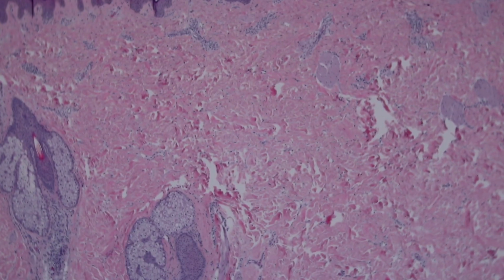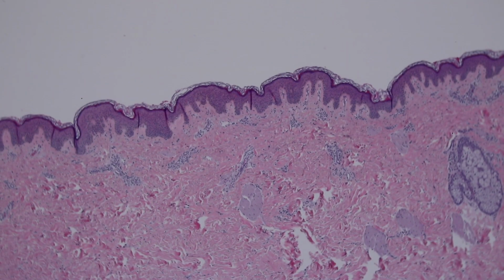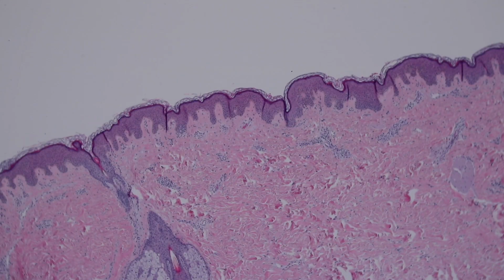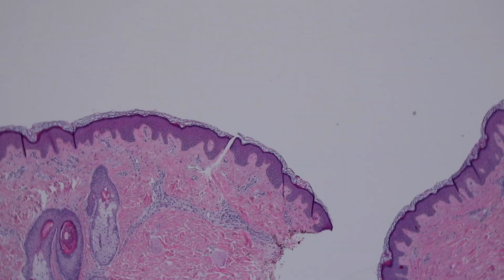And again, you can't see how this sweat duct travels all the way to the surface. It kind of seems to disappear, but it goes all the way up to the surface and empties out. And if you look around, we may be able to find another one where another one empties out, or maybe we won't. Maybe this piece of tissue doesn't have one.